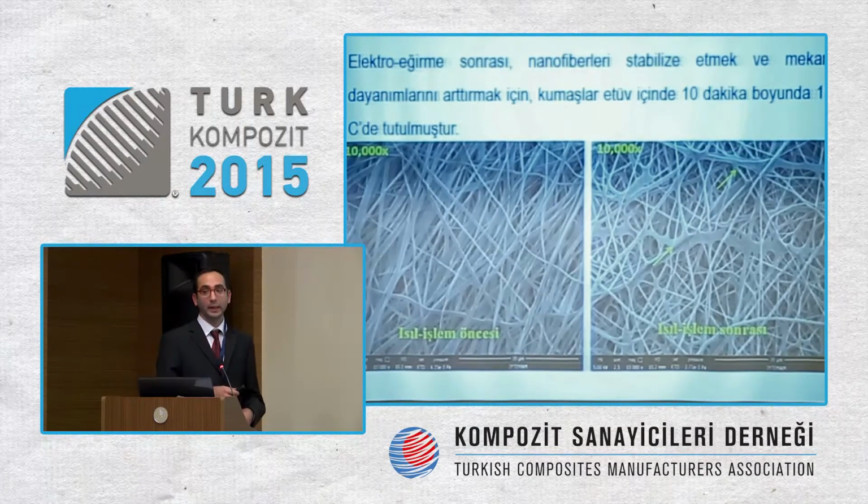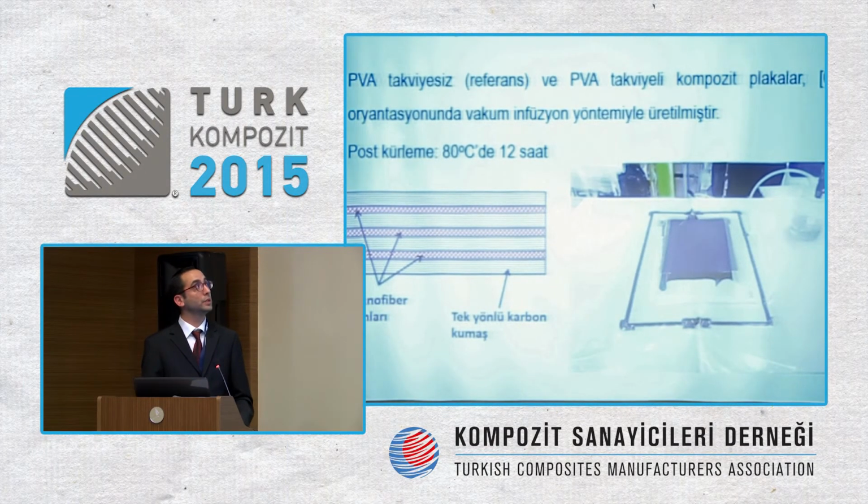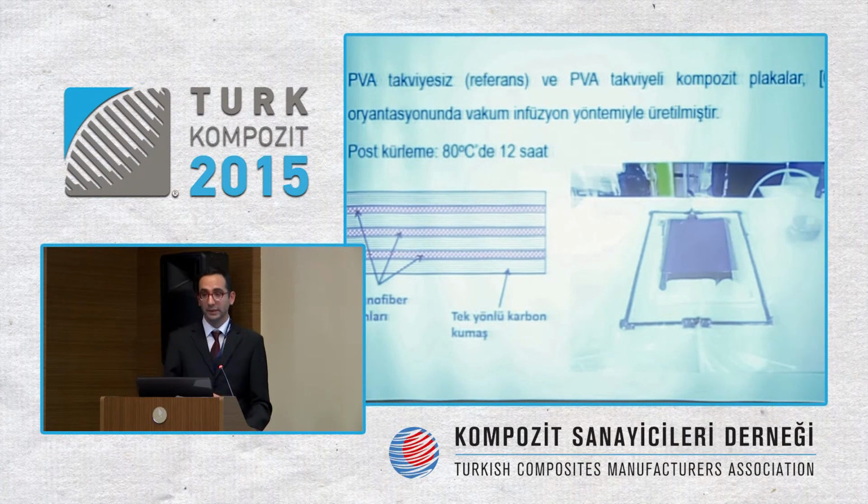And in line with the literature, in the post-electrospinning period, to increase the stability and the mechanical resistance of the fibers, we kept them waiting for 10 minutes at 150 C. And you can see that they are connected to each other as webs, and we can see it more clearly in the right-hand side picture. And then those fibers were taken, and composite test samples were created with vacuum infusion. Then we manufactured carbon composite, and you can see the interface, the core face.